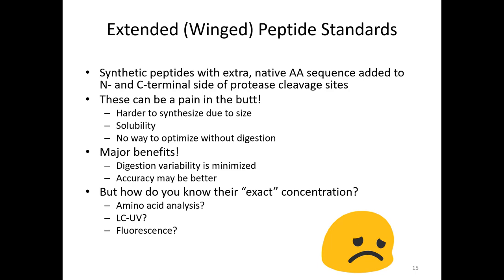So that's kind of the issue. If you purchase a peptide for $500 and it's enough to do thousands of experiments, then how do you make sure that on day 1 you get the same response as on day 30, as on year 1, right? There are a lot of assumptions that people make where like, oh, it says it on the label, it's totally good. And I've seen experience-wise that peptides have issues, some even at minus 80. So you can start with a number, but that's probably always going to be the highest concentration of that stock you will ever work with, right?